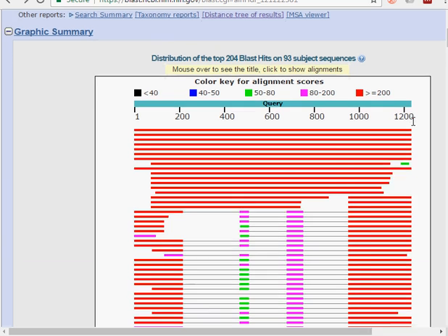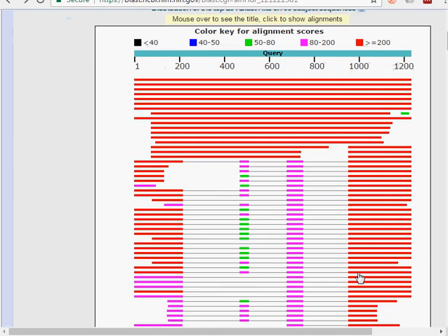Below is a series of alignments, basically sequences from the nucleotide database that were identified as being similar to the query sequence. The information is organized in such a way that the better quality alignments are provided first.